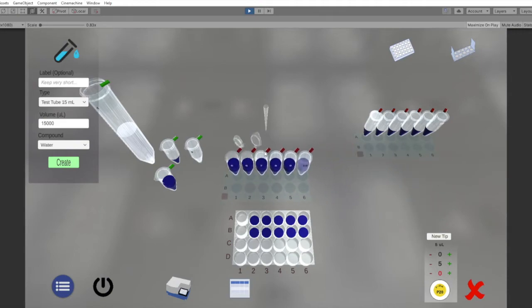And now I'm going to put 5 and 10 microliters of each of the dilutions of the unknowns that we made into rows C and D. And again, we'll speed that up slightly so that we don't have to watch it all in all its painful process. 5 microliters of each going along the top and generating a new tip every time.